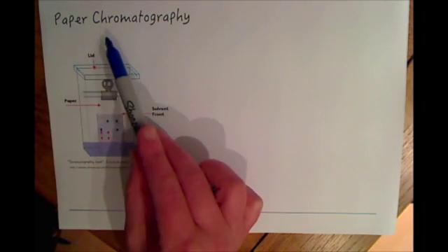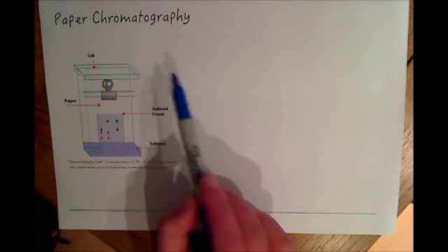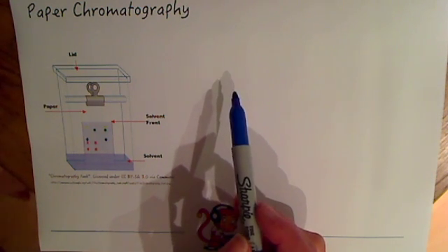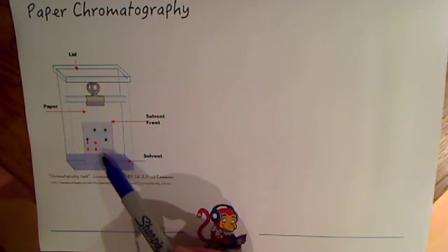Paper chromatography is a lot slower process. It tends to be used to have a look at banned food dyes and things in foods, and it allows for the separation of coloured compounds from a sample. For example, if I were to put a blue pen on the chromatogram, although it looks blue, there'll be lots of different colours inside this pen ink. Similarly, if I put a food dye on there - it might be a red food dye - actually within that food dye there are several different colours, and you might want to test to see if there is a banned substance.